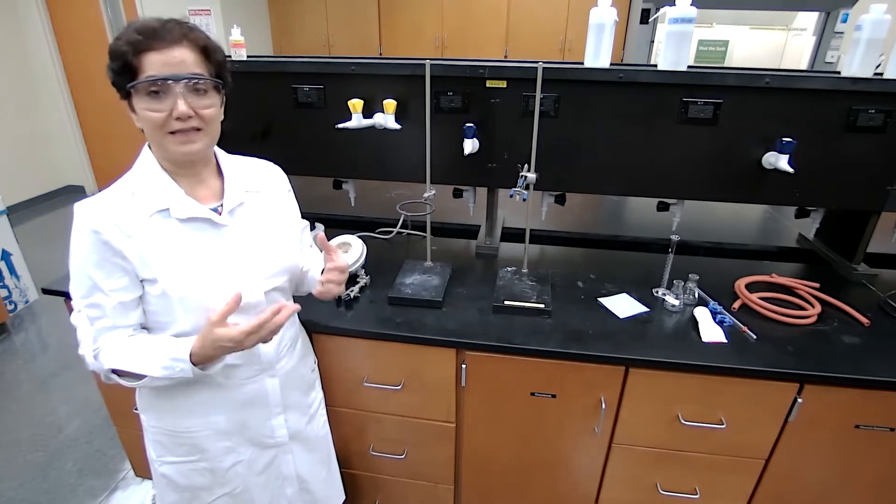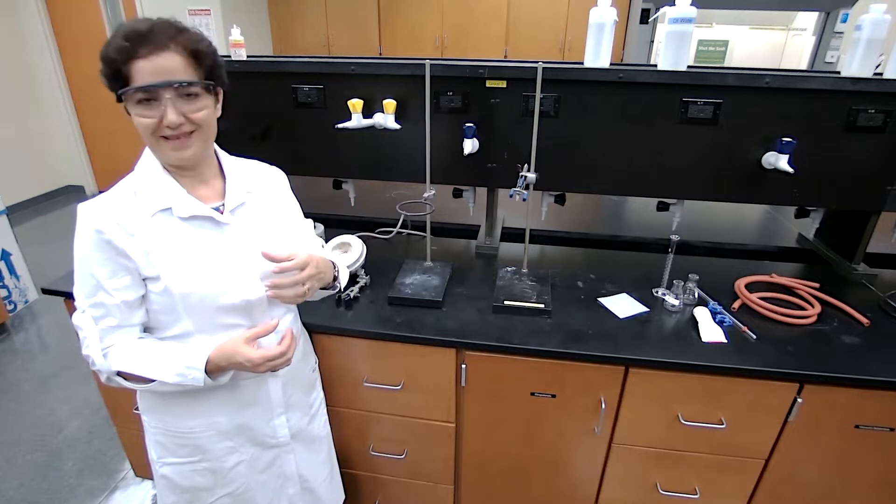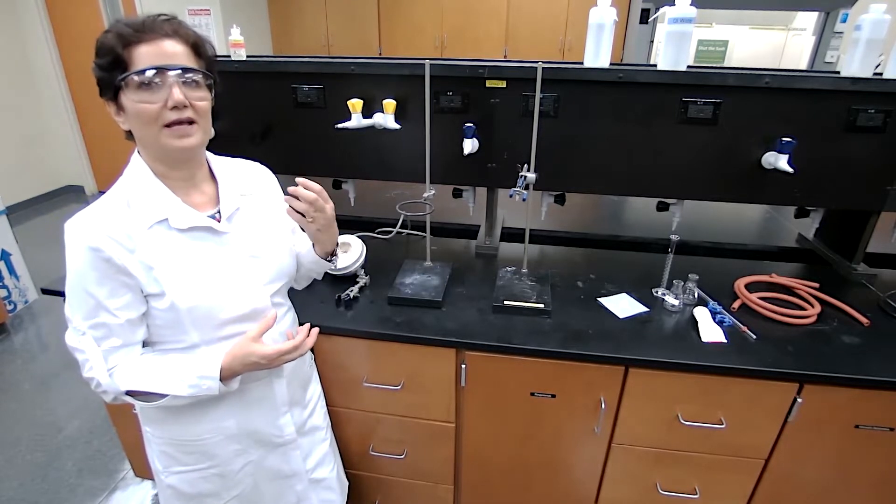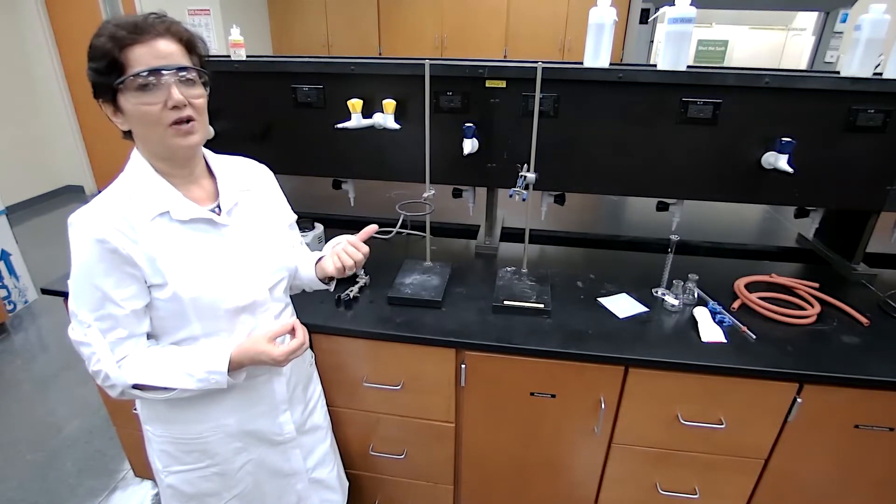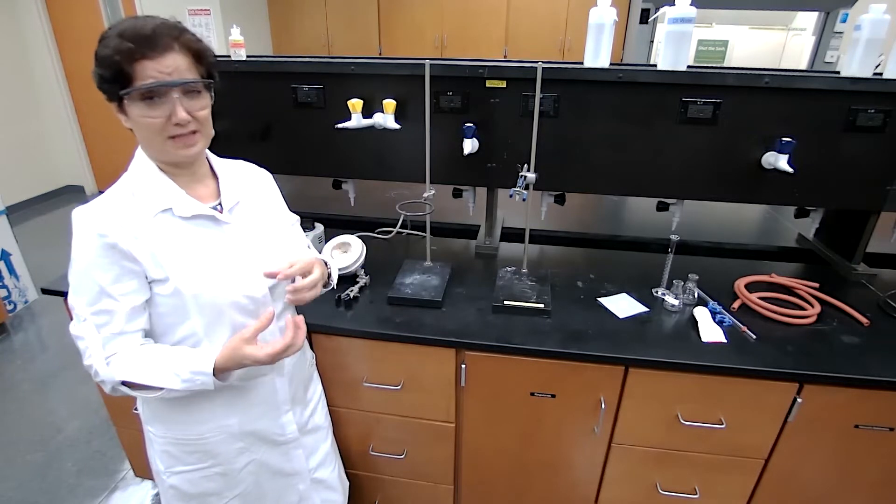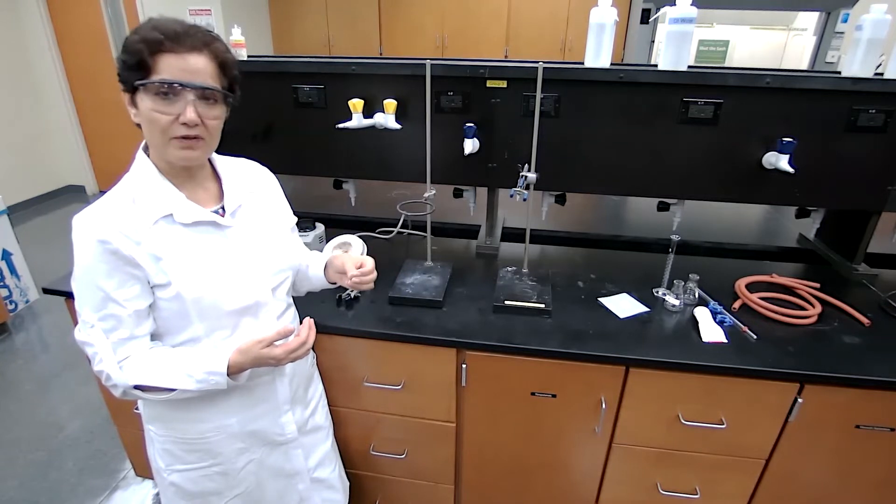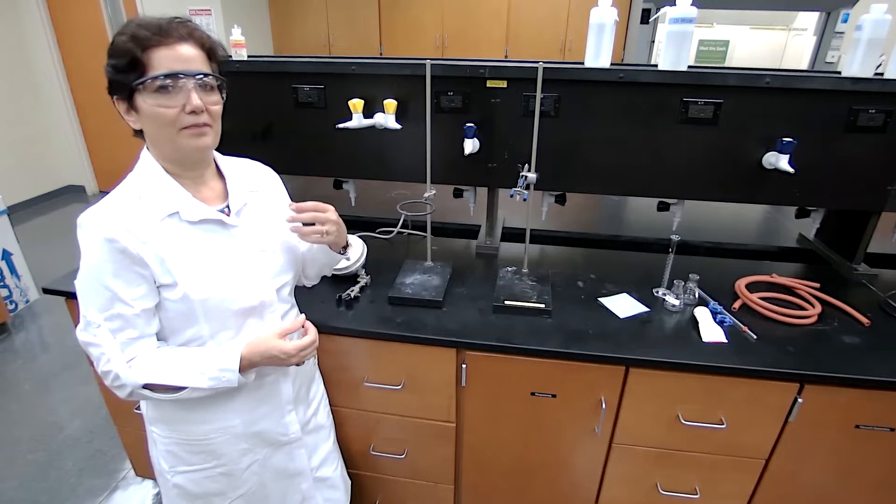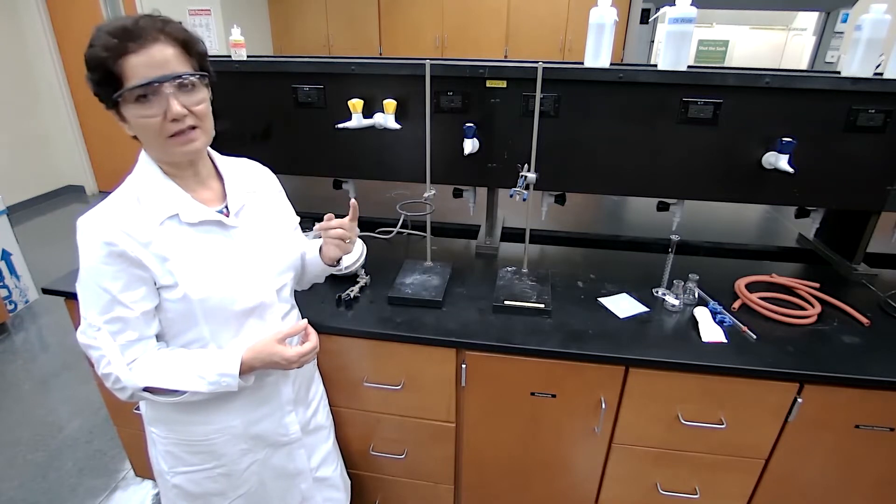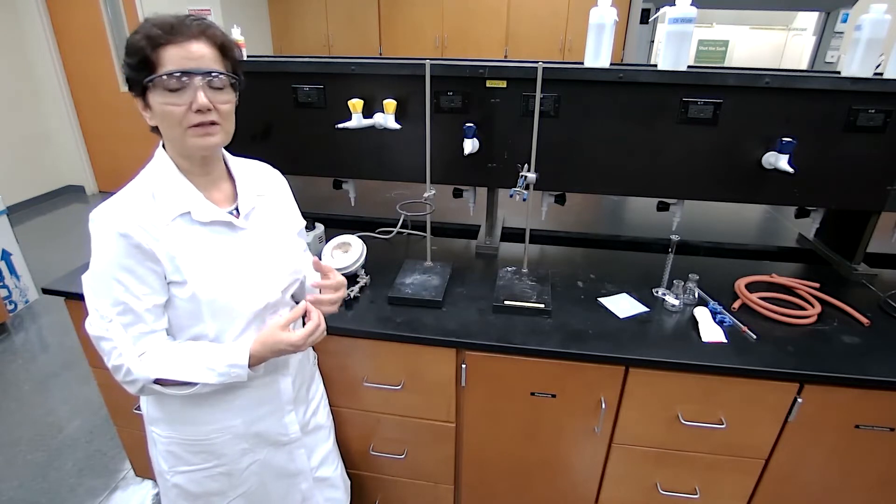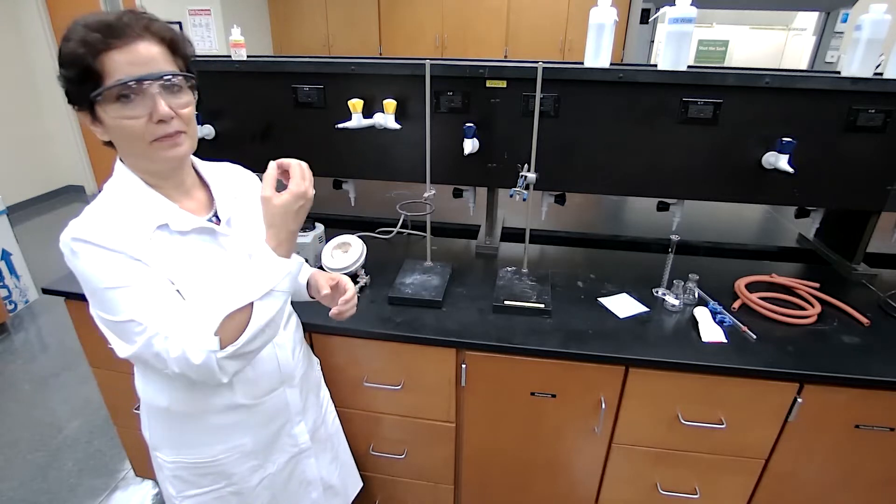When we are talking about distillation, we have a process. It involves evaporation and then condensation. In the evaporation, we have the mixture, and if one of the liquids has lower boiling point, it's going to evaporate first. For simple distillation, I actually chose a liquid plus a solid. That solid compound has high boiling point, so it's not going to evaporate. So I know that only the volatile compound would evaporate, and that is going to give us the proper vapor to measure the temperature. So if the temperature is coming from vapor of that single compound, which is my volatile compound, which I'm using methanol today, it's going to help me to calibrate the thermometer and make sure the setting is correct, like the positioning of the thermometer.